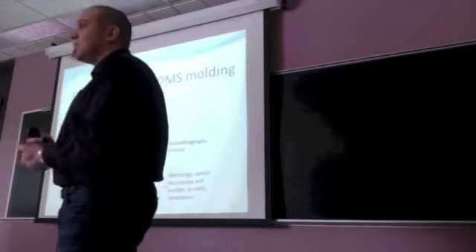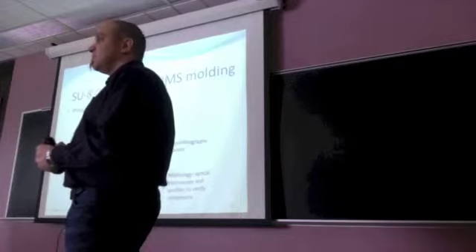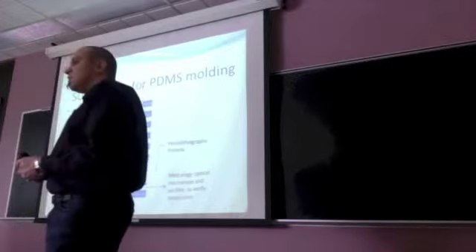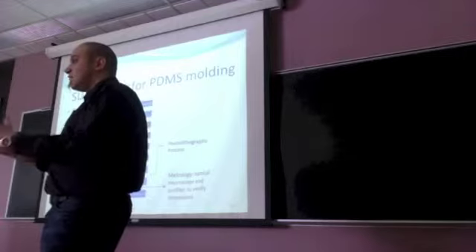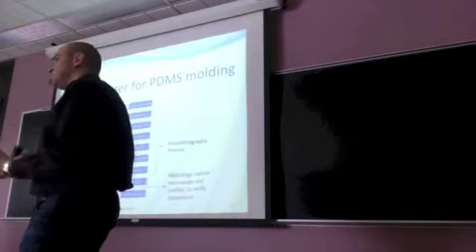At home, it can be high also. So for sure, it depends on the humidity level in the room. And sometimes in the semiconductor industry, the wafers after wet etching, after native oxide etching, are kept in a small box, and the atmosphere in this box is also controlled, with no moisture.